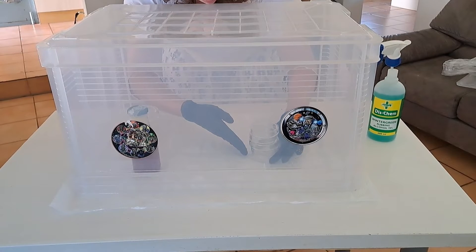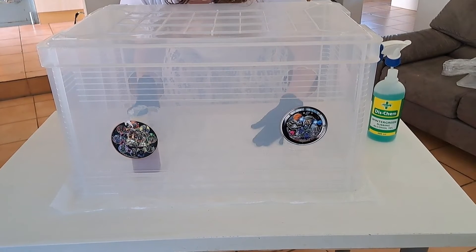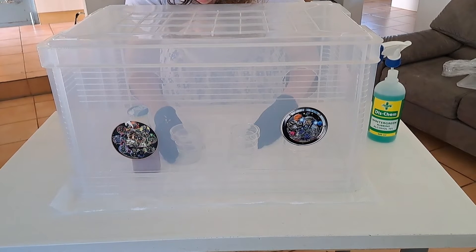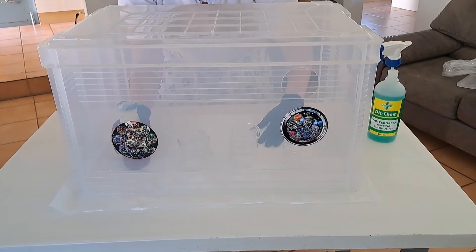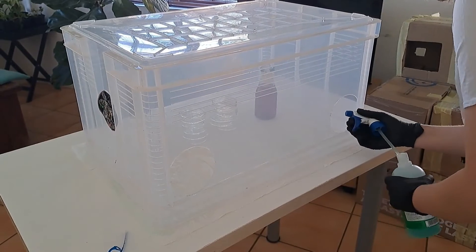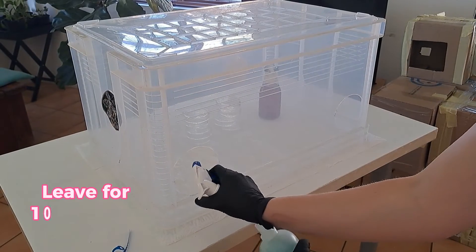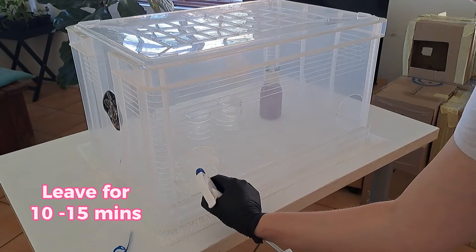Keep the petri dishes closed as much as possible so they don't open when you're moving them around. Now that I've removed everything I don't want in the still air box, I need to sanitize it before doing any inoculations or transfers. I'll put everything in the correct position I want it in, then spray down the still air box thoroughly with rubbing alcohol and leave it to sit for about 10 to 15 minutes, so the rubbing alcohol pushes down anything floating around before I start any transfers.